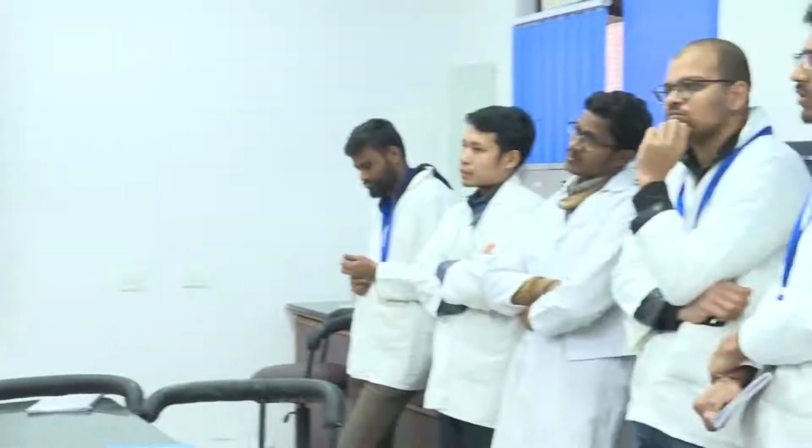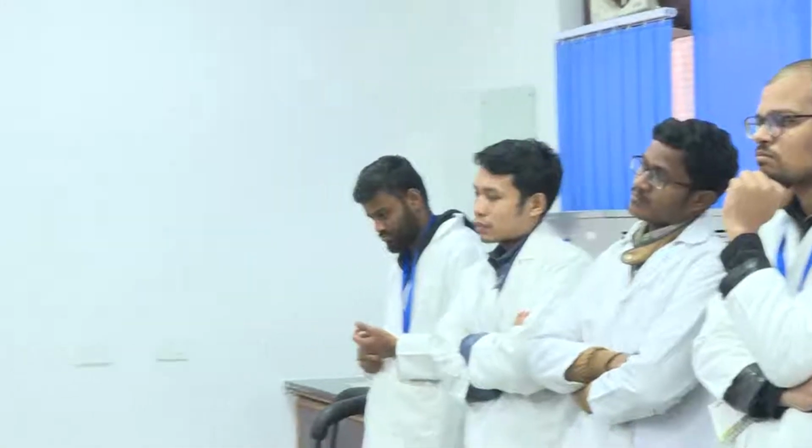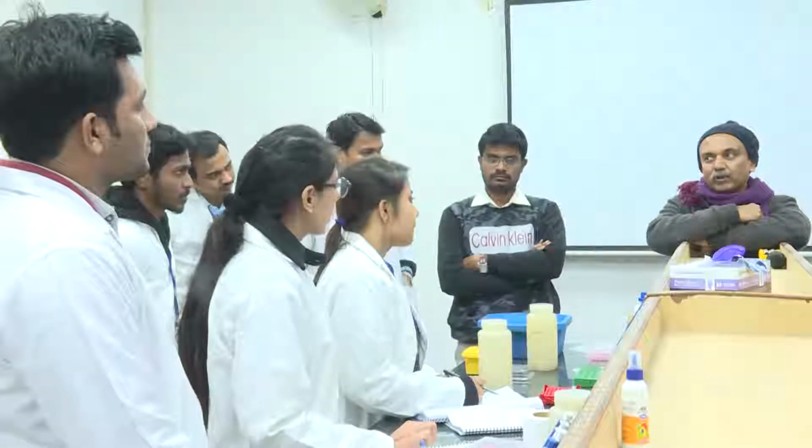How many days does it normally take you to quantify bacterial culture from an environmental sample? It depends on the organism of interest. Some organisms come up within 24 hours, some take several days. If you are interested in quantifying, say, methanogens or chemoautotrophic organisms, how many days of incubation do you anticipate?